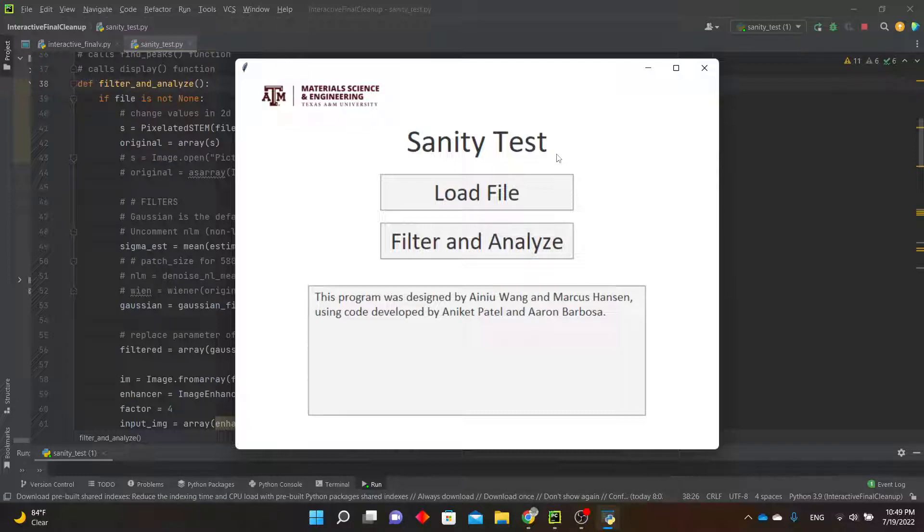In this video, I will demonstrate how to use the Sanity Check program that comes along with the main PED strain mapping program.